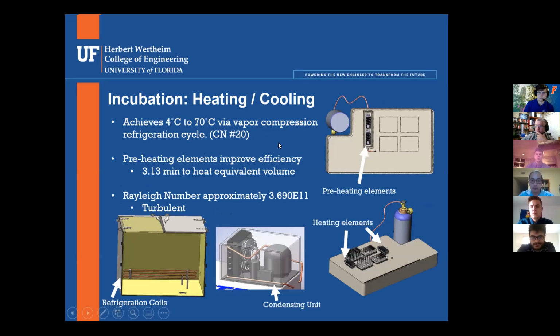And so to just go over the heating and cooling elements that we've included in our design, when the gas is introduced into the system, it passes these preheating elements shown in the top right. And so this would be a bottom view of the overall design. The preheating elements would allow the gas to be heated before passing into the main incubation chamber. The reason we included these preheating elements is to improve the efficiency. After doing some very simplified calculations, in order to fill the entire incubation chamber with preheated gas, it would take a little bit over 3 minutes.